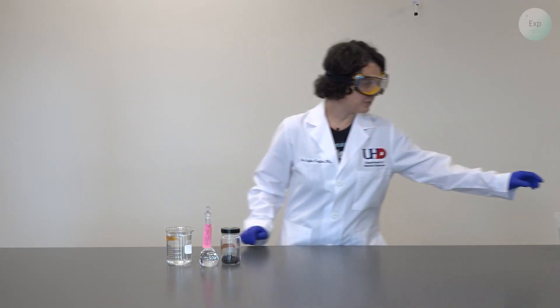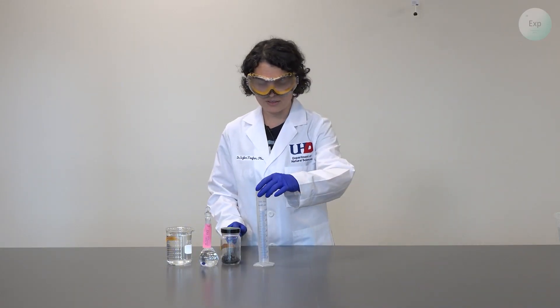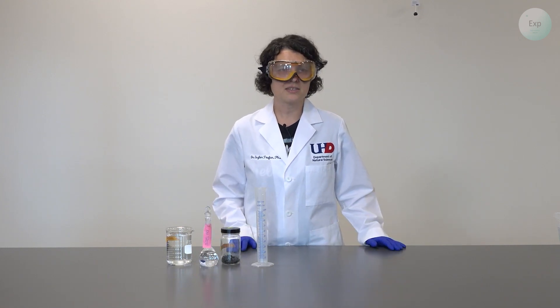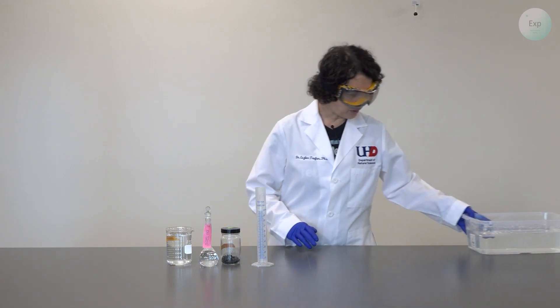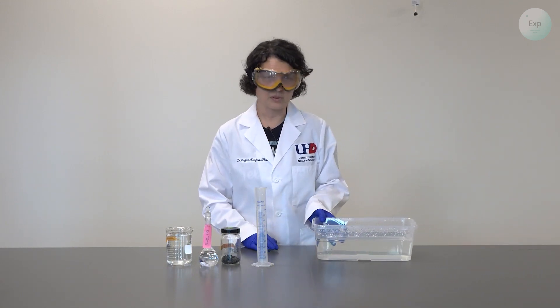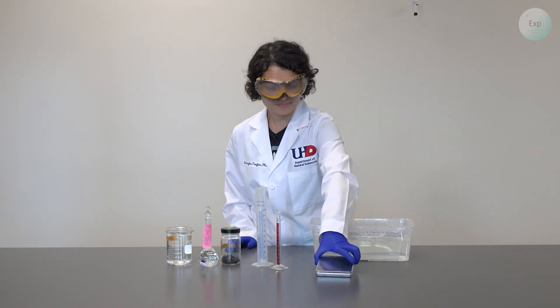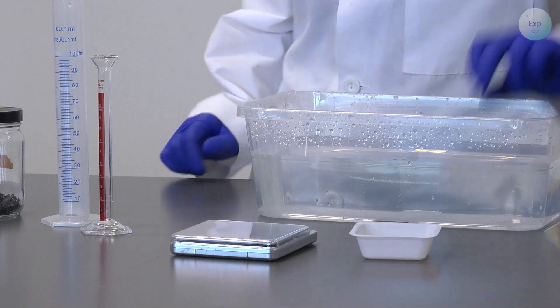For our equipment, we will need a 100 milliliter graduated cylinder — this can be made of plastic or glass, it doesn't matter, but it should be as large as possible. We'll also need a tub or a very large beaker filled with water; this can be tap water. We'll need a 10 milliliter graduated cylinder, a scale, a weighing boat, and a large test tube.